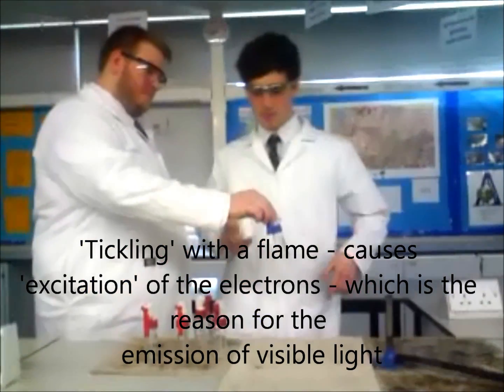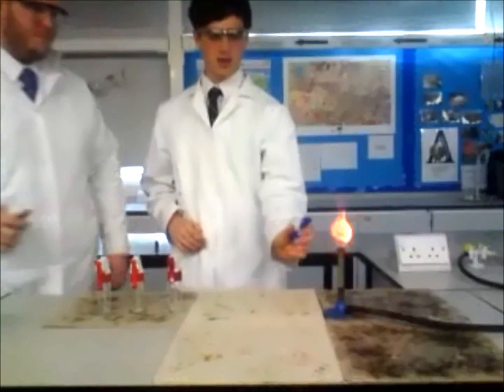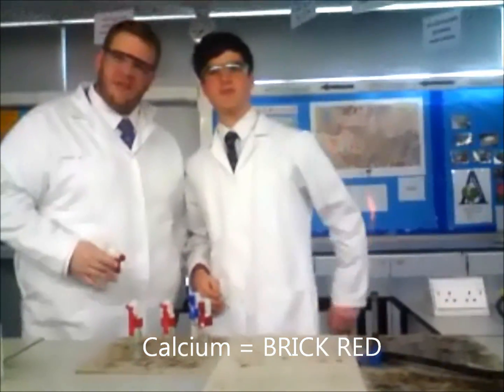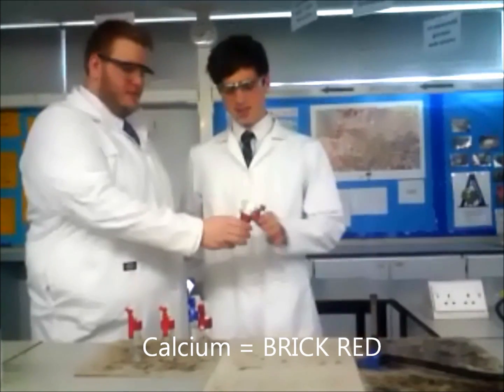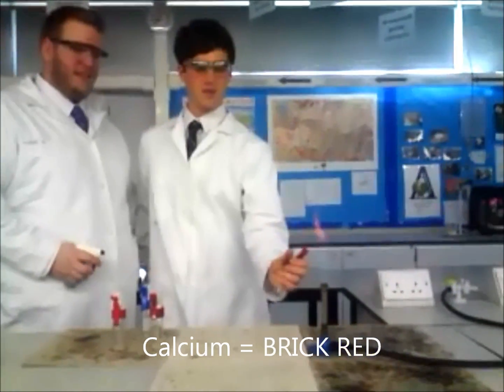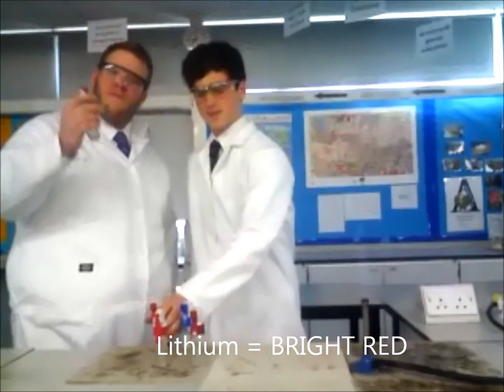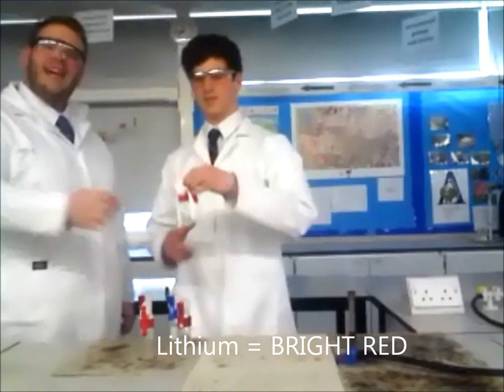Each colour is unique. That colour relates to calcium — calcium is a brick red. A much deeper red, but very bright still, that colour is lithium.